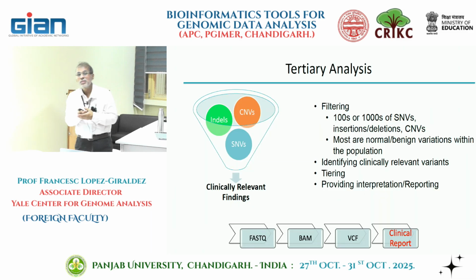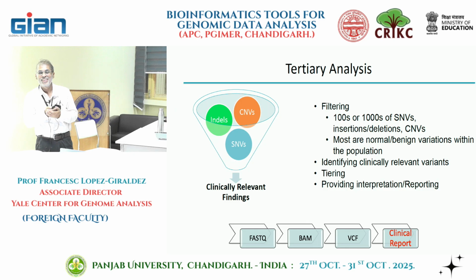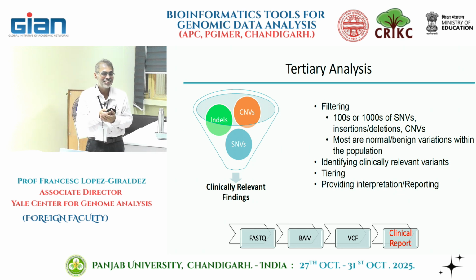Also, Amitji, just one more thing. Since you are in PGI, you always get only human samples. But also remember the organism you are aligning to. I have personally aligned human data to mouse, or mouse data to human. So it is important that you also choose the genome of the organism you are working on.